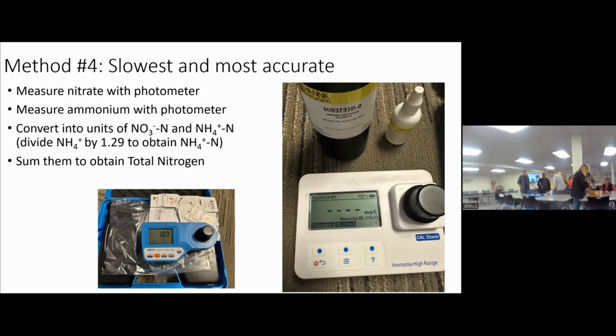And this instrument actually walks you through and tells you what to do. So you get this cuvette, you get this syringe. You get 1 milliliter, that means this whole syringe of sample. Put 1 milliliter inside the cuvette. Then you add the reagent. That one is really deep purple. So you put 9 milliliters until the line at 10.